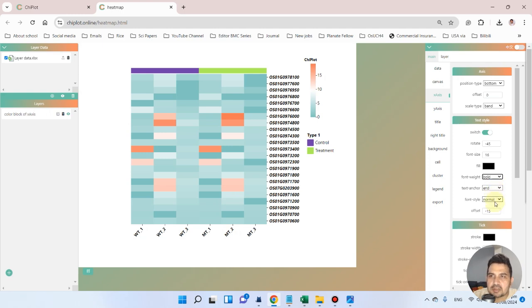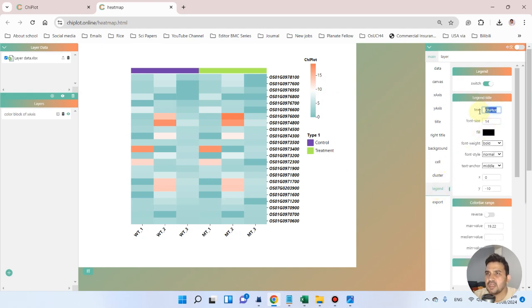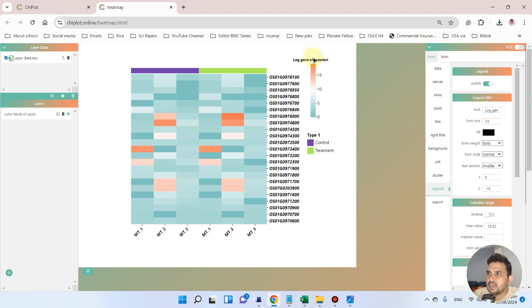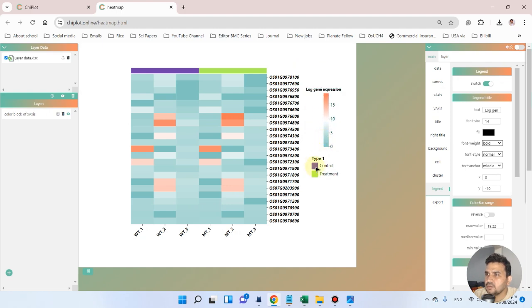We don't need to make the sample names italic. Now we want to add color based on expression values. Go to the legend option — here we have the label 'gplot' which we can change to 'log gene expression'. You can now see the legend reads 'log gene expression', and we can move it to use the space wisely.